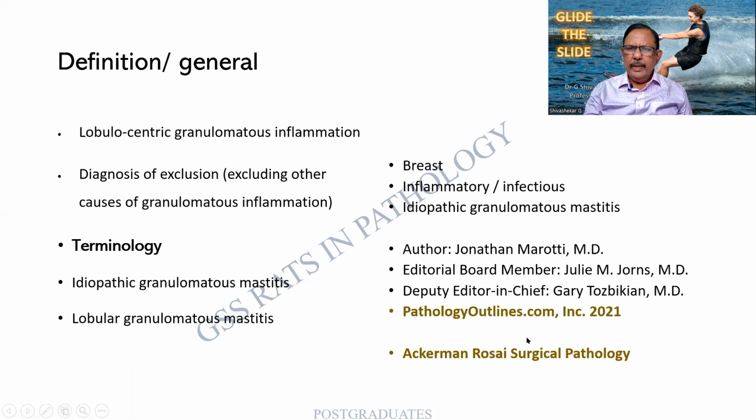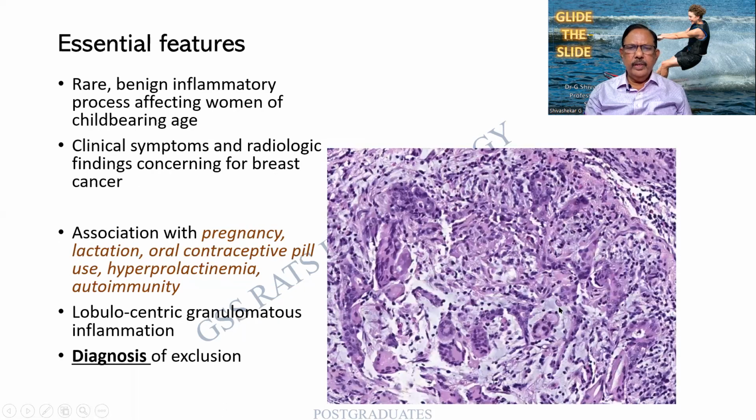And these two are my references in this particular presentation. One is Ackerman, the other one is pathology outlines. The details are given over here. This is yet another slide we shall be seeing. Try to concentrate on the slide and note down what all you can find.